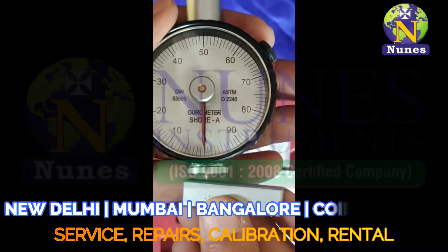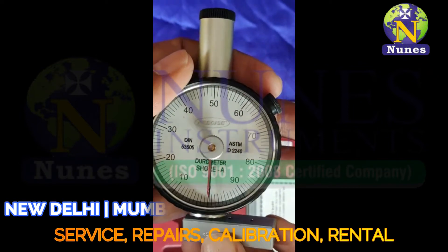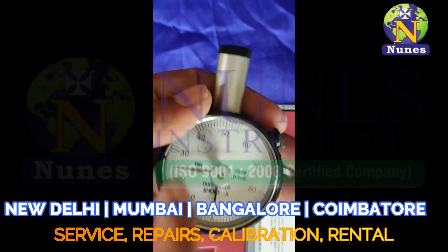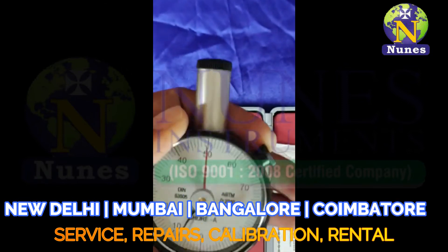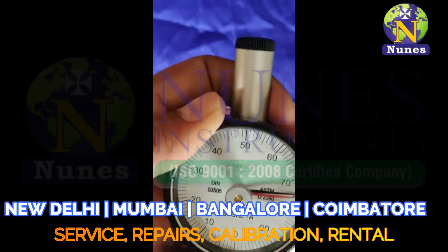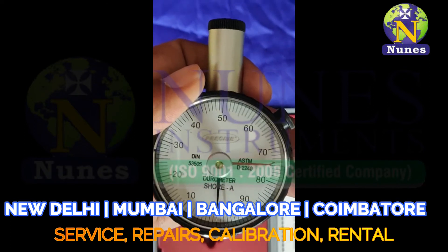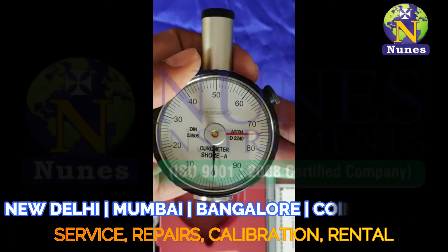So we will check: at 25 it shows 25, at 50 it shows 50, at 75 it shows 75. The biggest plus is that the red pointer stays at the last reading, which helps us to take the reading accurately.